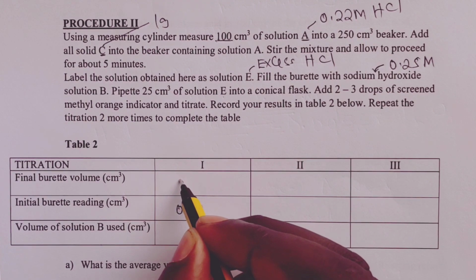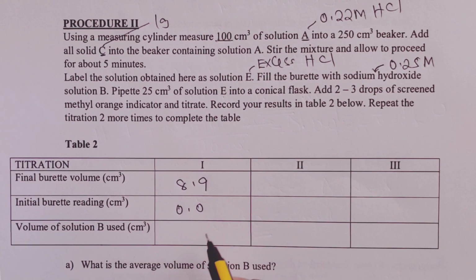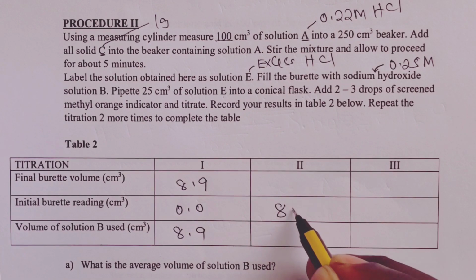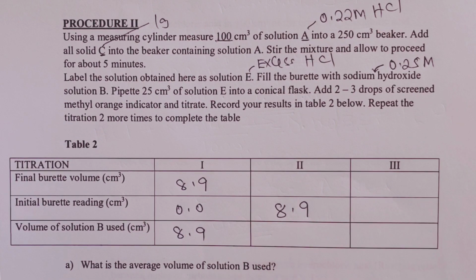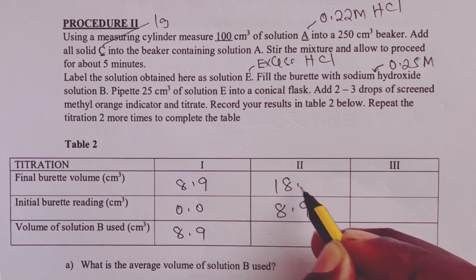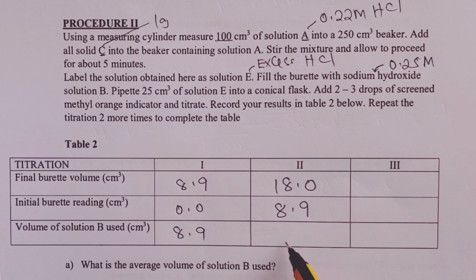After titration 1, we were able to read 8.9, giving the volume of B used as 8.9 cubic centimeters. Because the volume used was very minimal, we can afford to begin the second titration from where we stopped the first. Let's assume we got a final volume of 18.0. That gives 9.1 as the volume used.